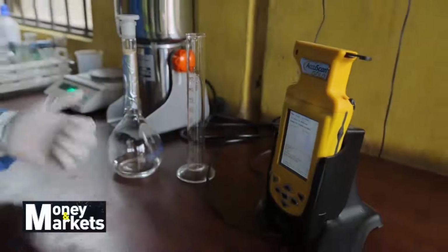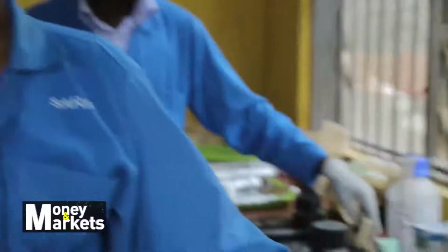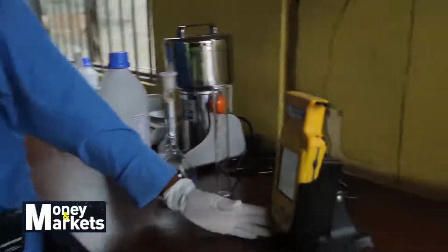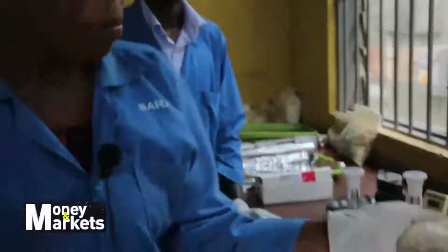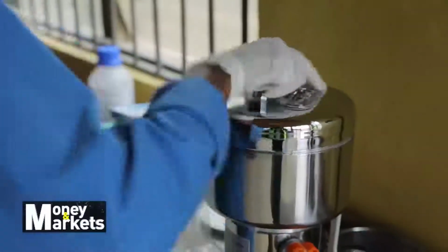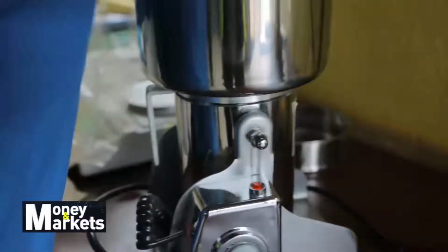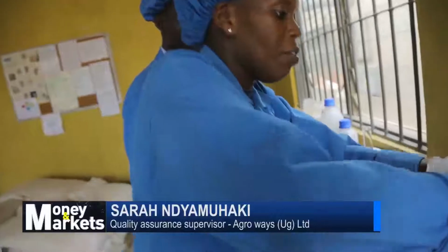So we take the samples of the maize and we use ethanol to determine the aflatoxin in the maize. And the basic equipment is the AccuScan Gold scan. After you have received your maize, for example, this is maize from Benjamin, you grind it using the grinder. After grinding the sample, you make sure you take all the precautions to make sure that the sample is not contaminated, because these are the results. We get them in ppb, which is a very, very small unit.